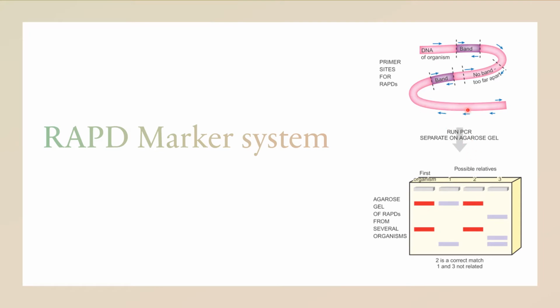But if the genetic background has changed, there are certain parts where the primer cannot bind and amplify, so it will not produce any band. It will not produce any amplification. It will not amplify that specific region. So when it's not amplified, it will not produce any band.